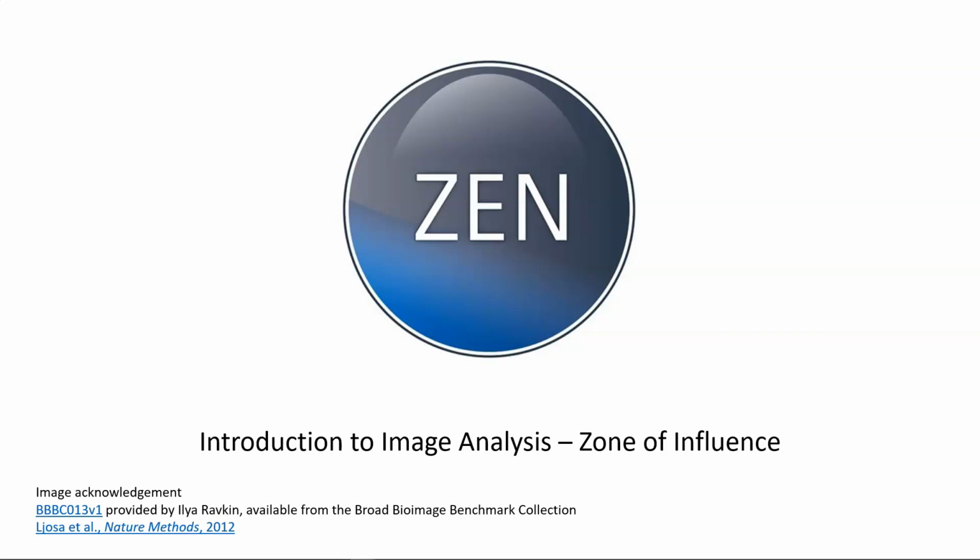Zen imaging software from Carl Zeiss provides a number of methods of quantifying image data. This tutorial is intended as a follow-up to the previous introductory walkthrough of the image analysis module and assumes the viewer is familiar with the basic concepts of thresholding or segmentation, filtering, and reporting of data.